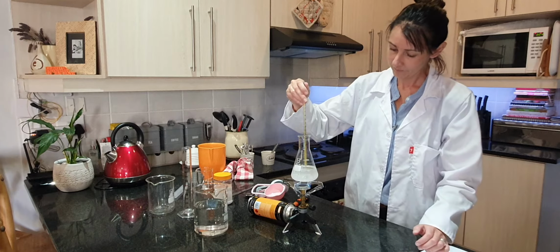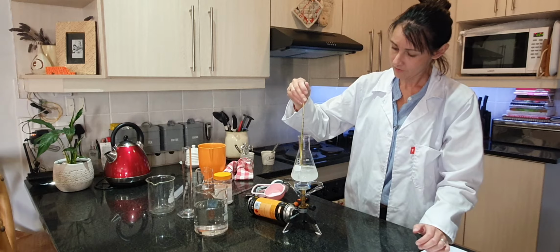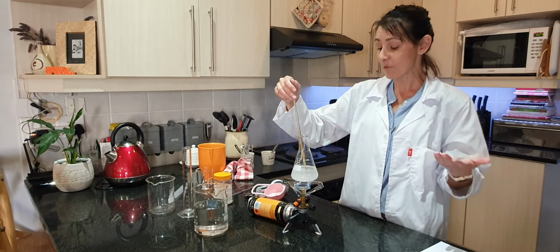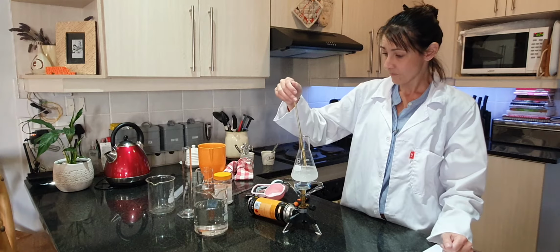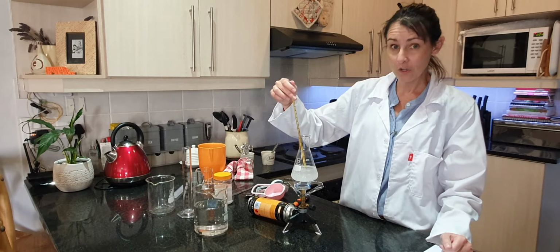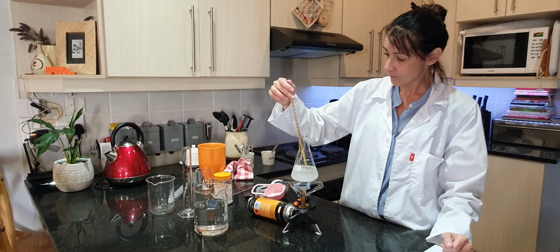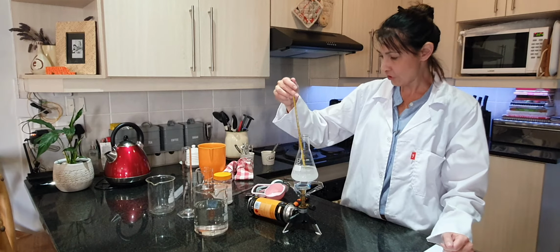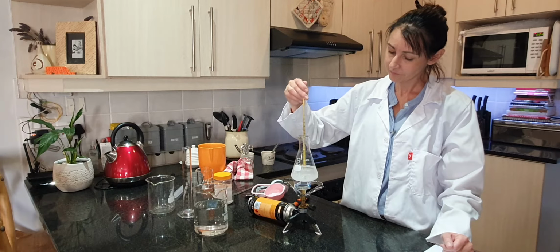Keeping it stirring. Okay, and also we want to see once that bubble starts to form. So you need to keep a close eye and see if you can see it. Okay, and we are on 32 degrees at the moment.